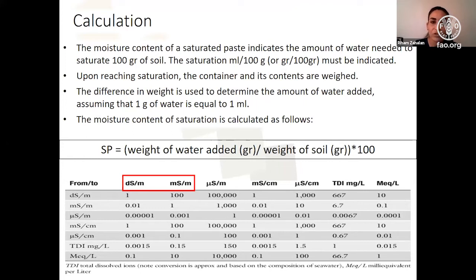Actually, if I want to calculate the saturation of a soil sample using another method, it may take from me 2 to 3 days in the lab, and it won't be as accurate as this. So we emphasize and encourage our colleagues to take as much information and results as possible from one method, so it will save time, effort, and money.